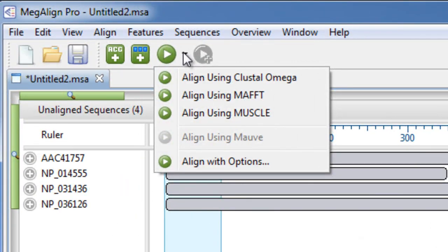MegAlign Pro offers the ability to align your sequences using four different algorithms: Clustal Omega, MAFFT, Muscle, or Mauve.